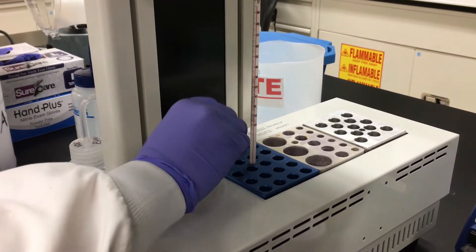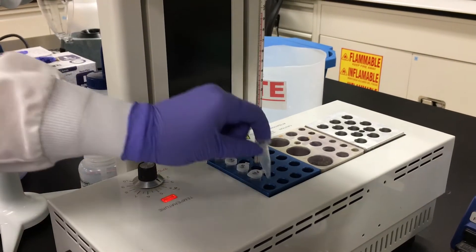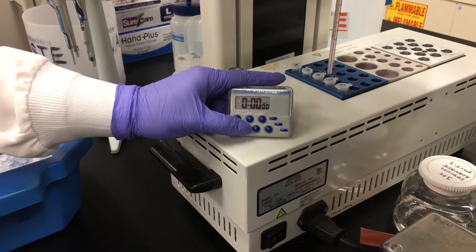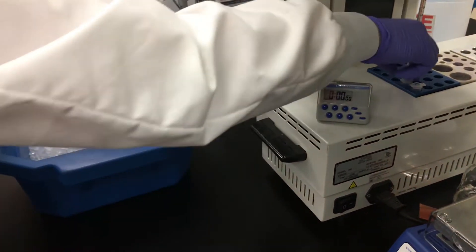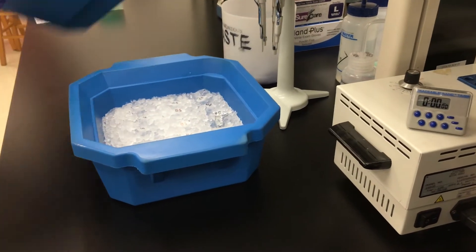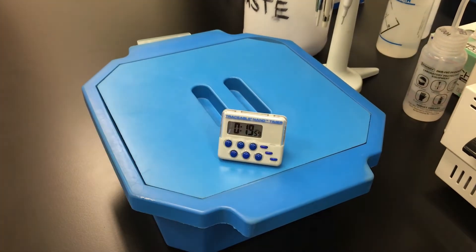Next, the samples are allowed to incubate at 95 degrees Celsius for two minutes. Once two minutes have passed, remove the samples from the heat block and quickly place them into an ice bath. Allow the samples to rest at 4 degrees Celsius or in your ice bath for 20 minutes.